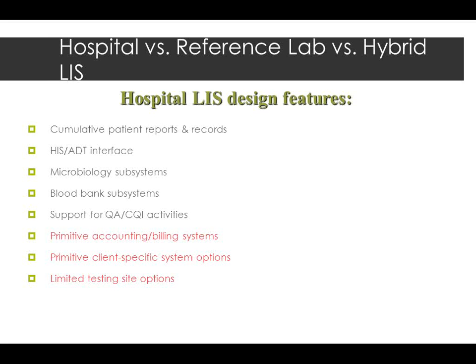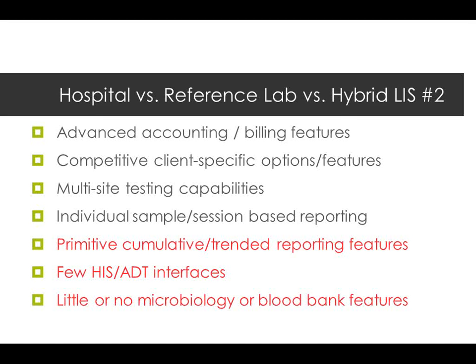Now, as we started banding hospitals together and more labs needed to be functionally like we have now with Mount Zion, Parnassus, and China Basin, where it's really, I consider it one lab at 3 sites kind of thing, and we function as an integrated whole. Previously, in the hospital environment, LISs didn't need to do that until probably the last 10 years.